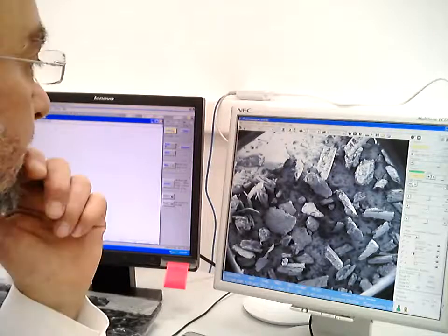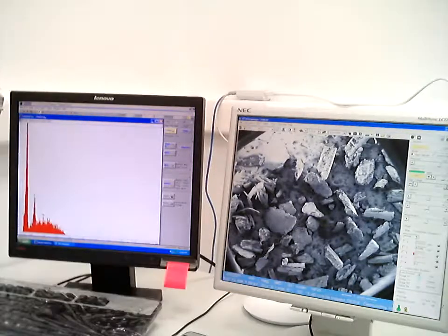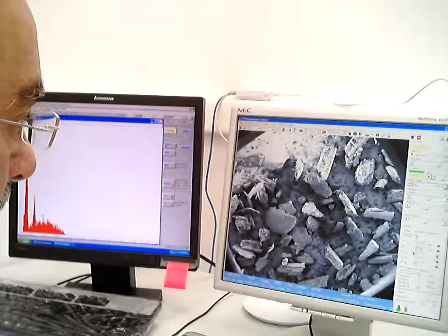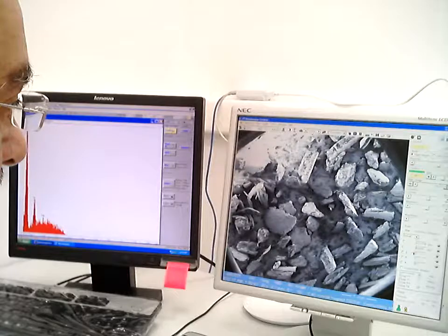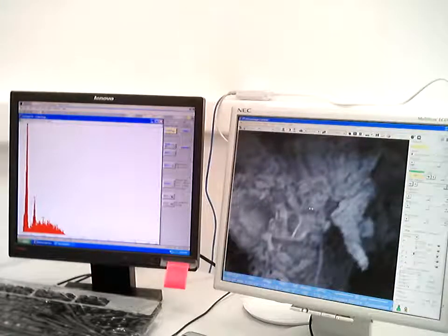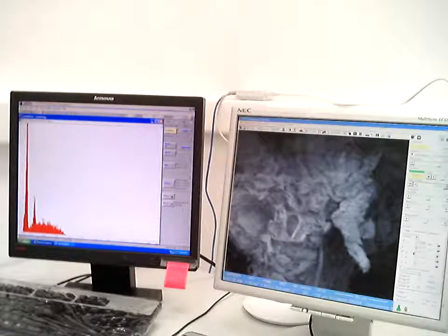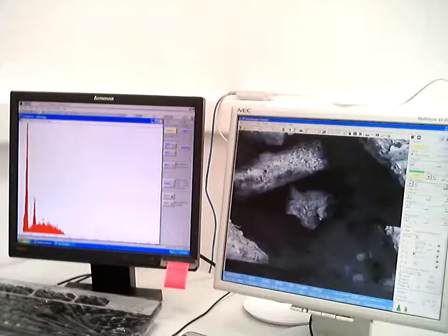And let's see if there's any obvious stone. This is all organic. This one is wood. It's obviously wood. Let's see this one. That could be a stone. Well, let's have a look. This one, no. It's quite a small piece of organic mixed with inorganic materials.